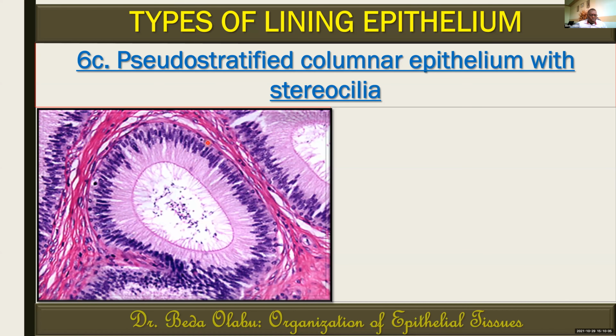This is what I want you to do. Imagine that you are able to divide this epithelium from the basal side to the apical side into zones. The number of zones you want to divide it into doesn't matter. Maybe divide it into 2 zones, maybe 3, maybe 4. I usually prefer 3 or 4.